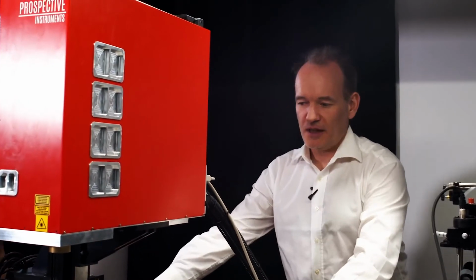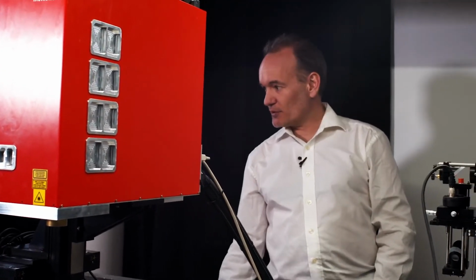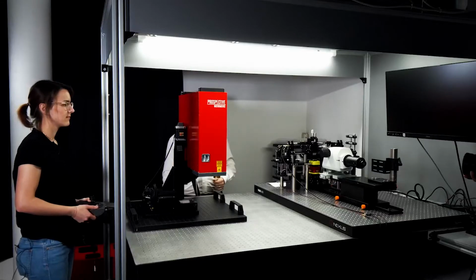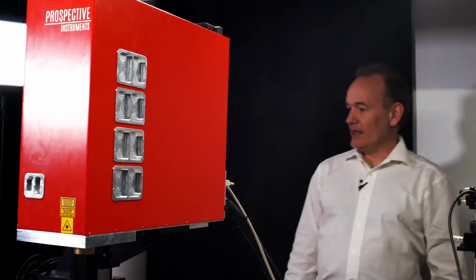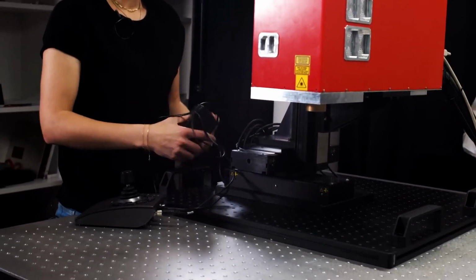And now there needs to be some cabling done. The PC is included in the microscope controller, so we need to fix the keyboard, the mouse, the screen. Actually, the screen is over here. We already prepared that. So we're going to plug in the HDMI cable of the screen and actually the joystick. Stefanie is holding the joystick.